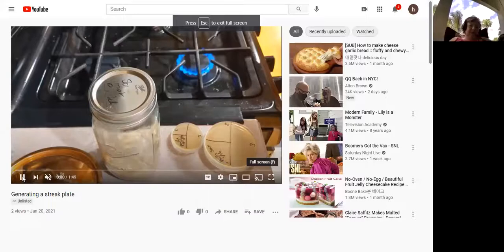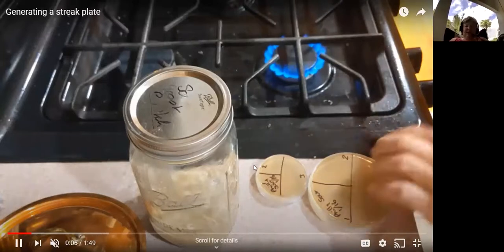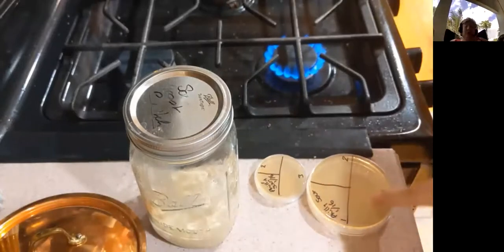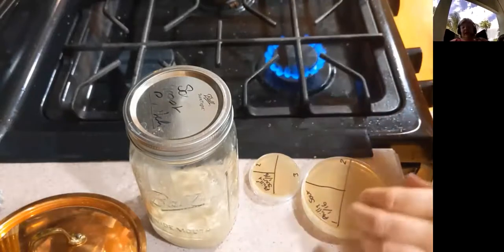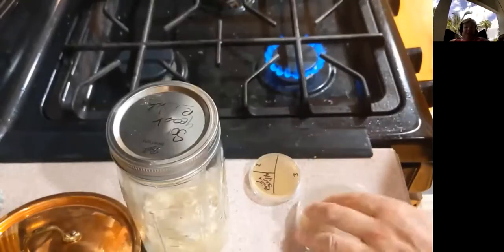So a streak plate is a methodology that's used to dilute out organisms. I have a number of agar plates that I have divided, and I've written on the back, not on the lid, because lids can fall off. I've written the date, what I am culturing, and I've divided it into 3 quadrants, 1, 2, and 3. And then I have a metal loop, and I'm going to sterilize my metal loop by putting it in the flame, allow it to cool, and then pick up some bacteria from my culture.